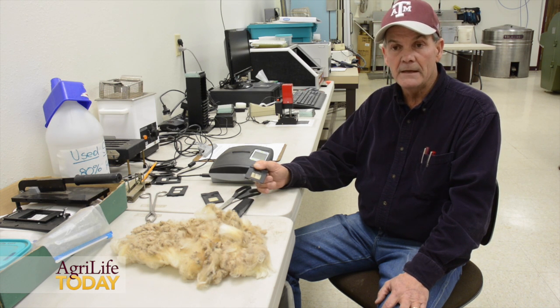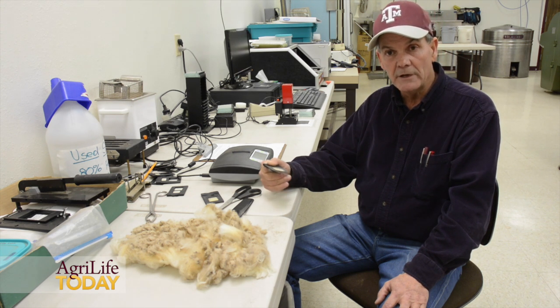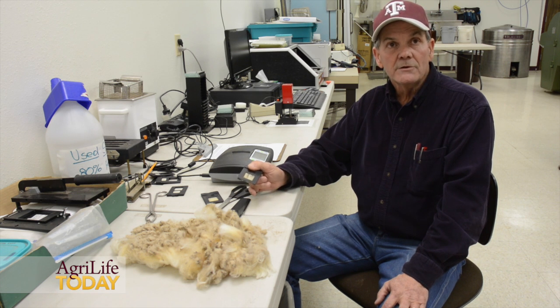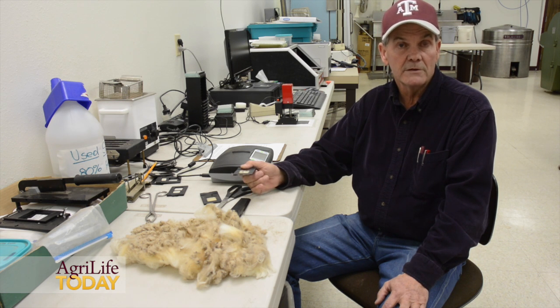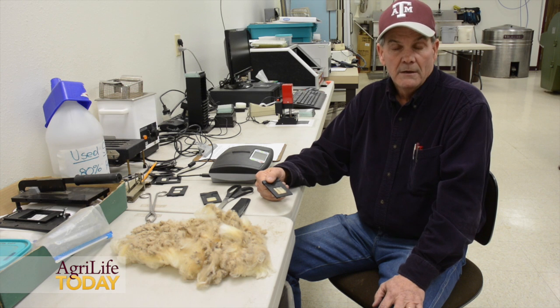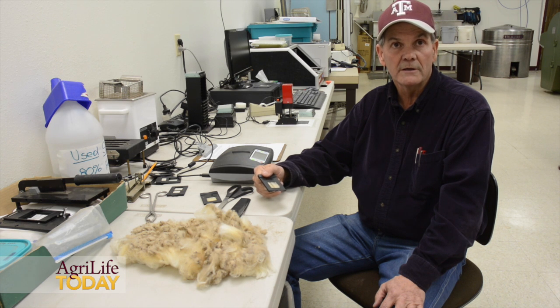Also, in fleece separation for packaging and marketing, if you've gone in and tested your sheep, you could sort them prior to shearing based on fiber diameter. This is a new company and a new instrument — as far as we know, we're the first ones here in the United States to have purchased one. The company is manufacturing them and selling to the commercial market at roughly $2,000, which would include shipping and handling here in the United States.